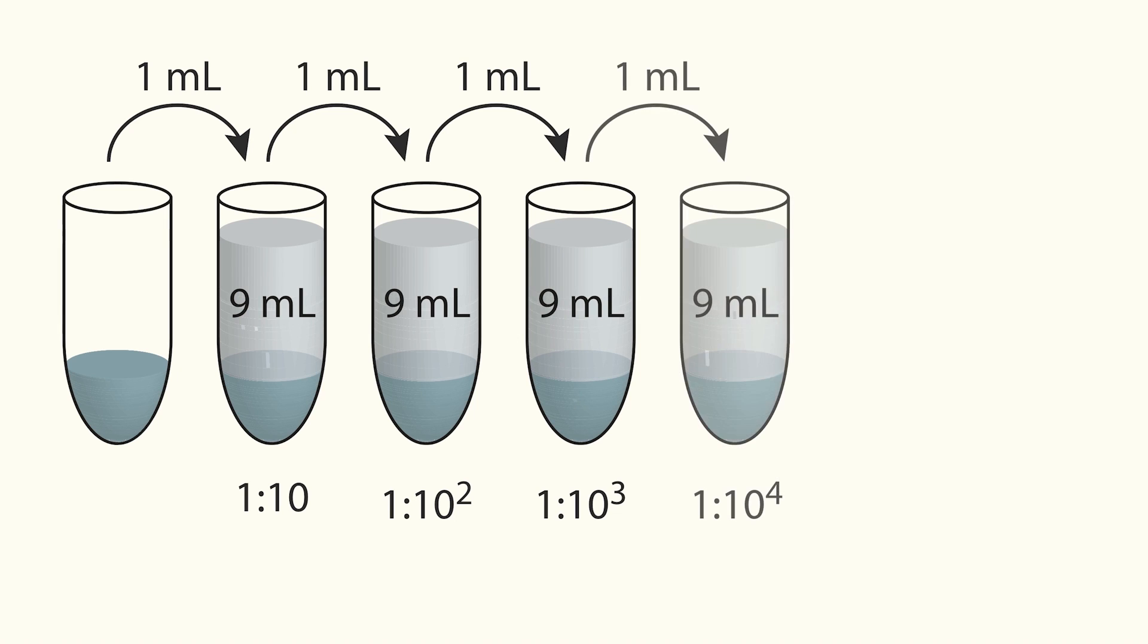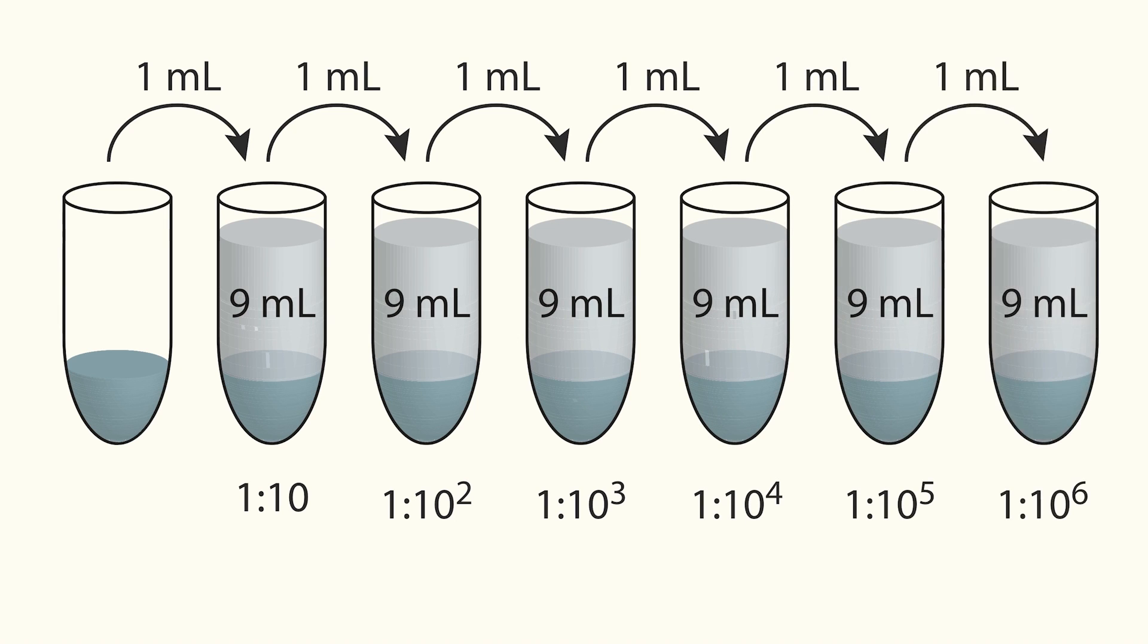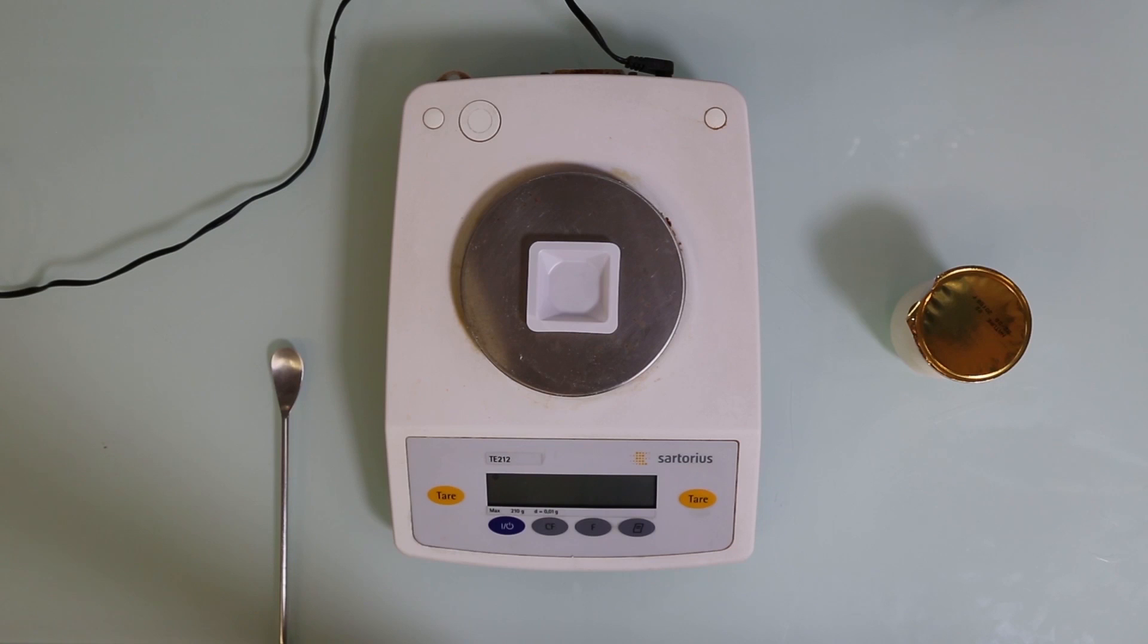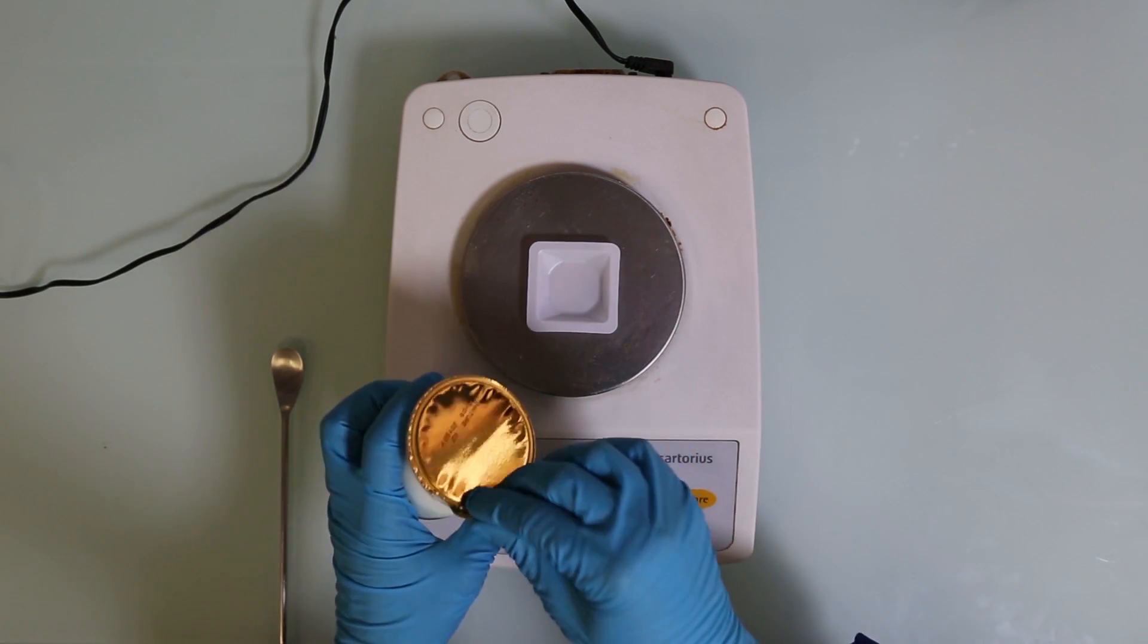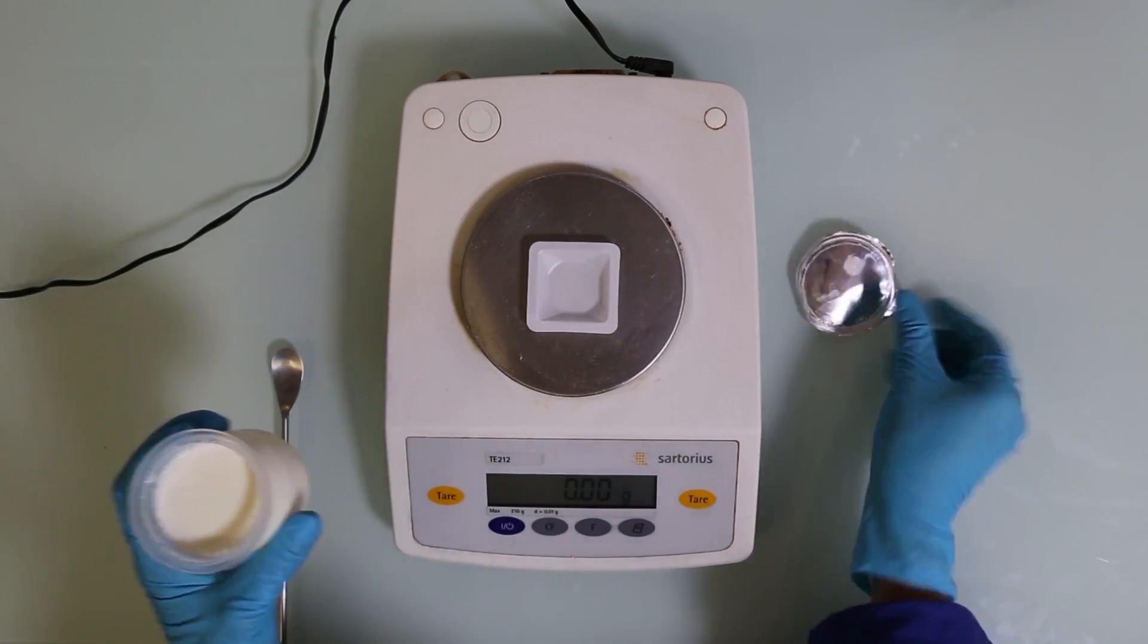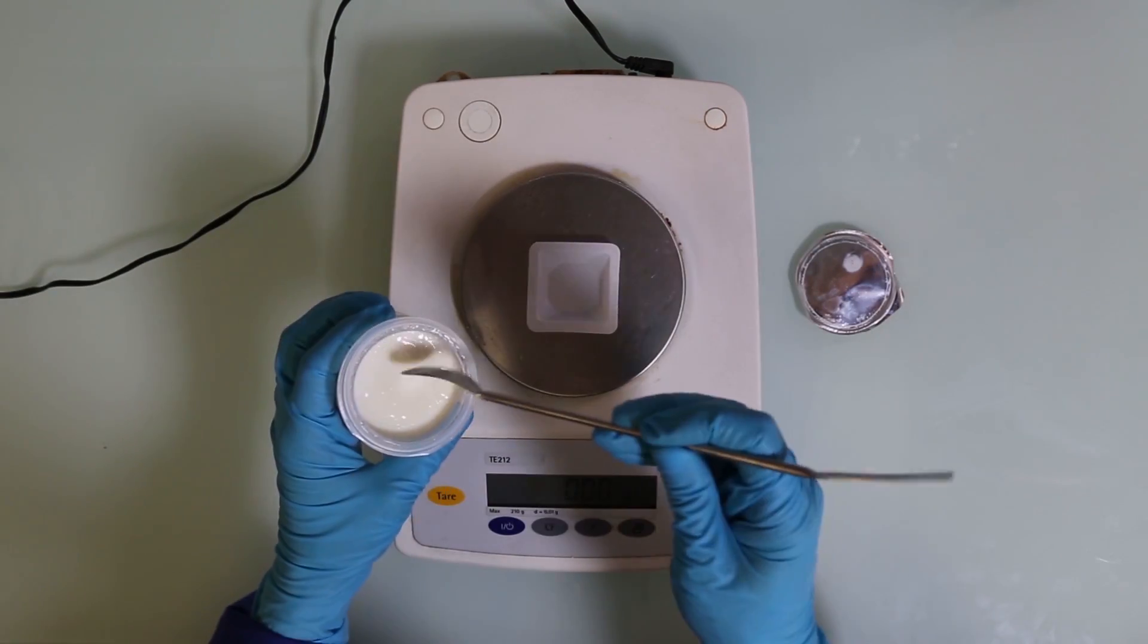If you do that six times, you have 1 in a million dilution that you had wanted, but using much less water. First, let's weigh out 1 gram of yogurt and mix it with 10 milliliters of water. That's our first 1 to 10 dilution.